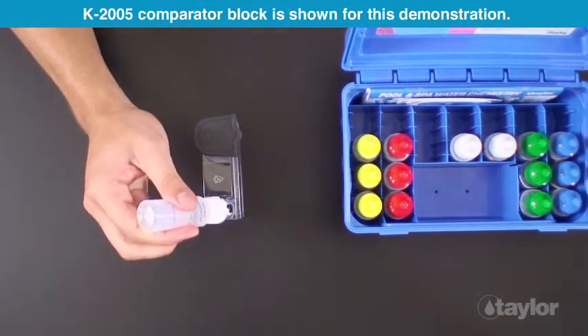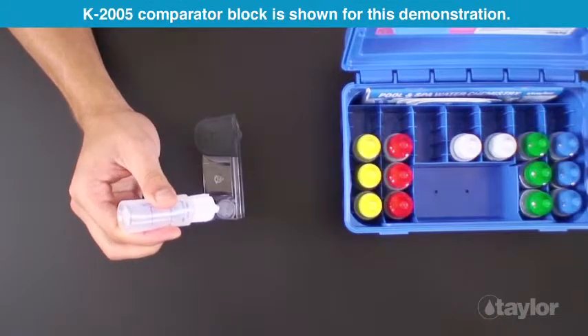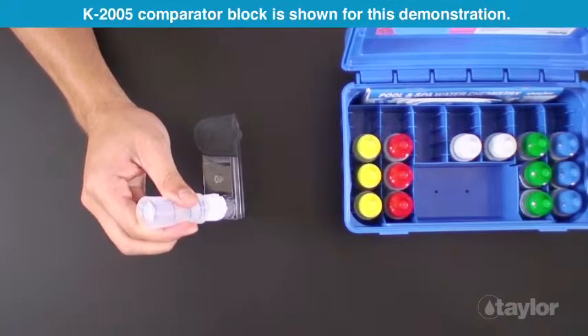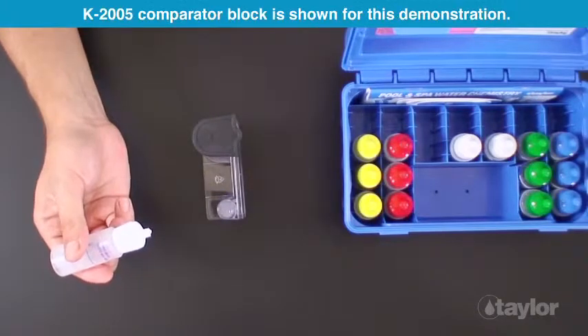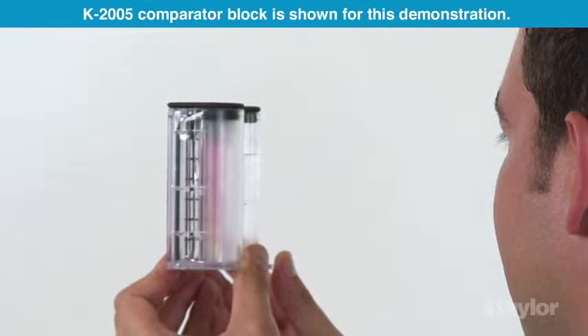Slowly transfer the cloudy solution to the small comparator tube until the black dot on the bottom just disappears when viewed from the top. Read the tube at liquid level on the back of the comparator block.